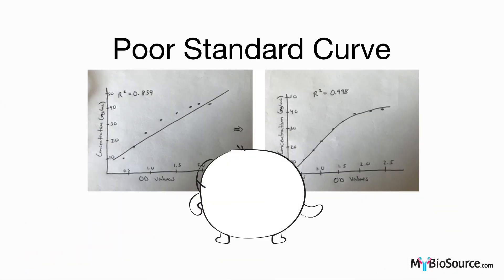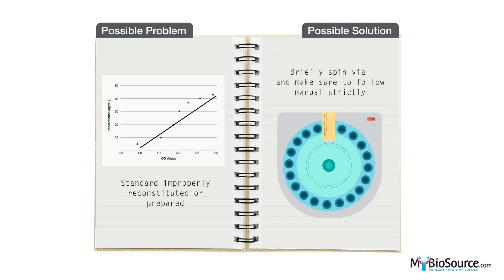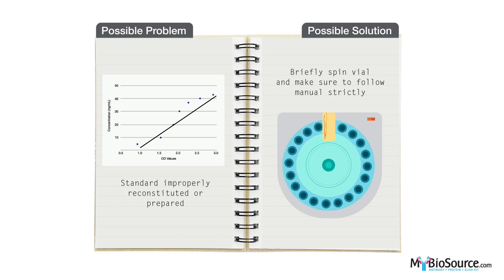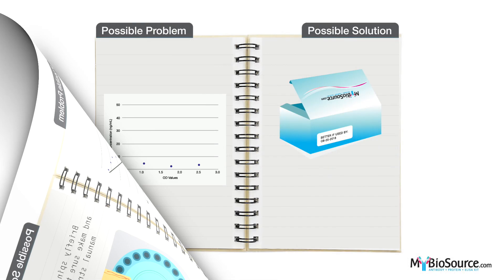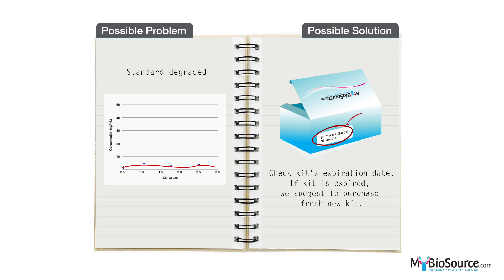If you are getting a poor standard curve, this may be caused by the standard being improperly reconstituted or prepared. In this case briefly spin the vial and confirm the standard is thoroughly dissolved. The standards in the kit may also be degraded; please check the expiration date to ensure your kit is not expired. If it is expired, we suggest purchasing a fresh new kit.